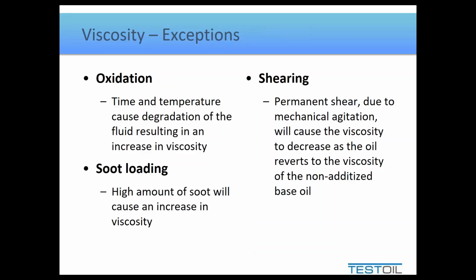As we degrade an oil, it will form acids. As it forms acids, it forms other degradation products. These tend to be insoluble and thicker than the base oil viscosity. So slowly but surely, the viscosity will increase over time.